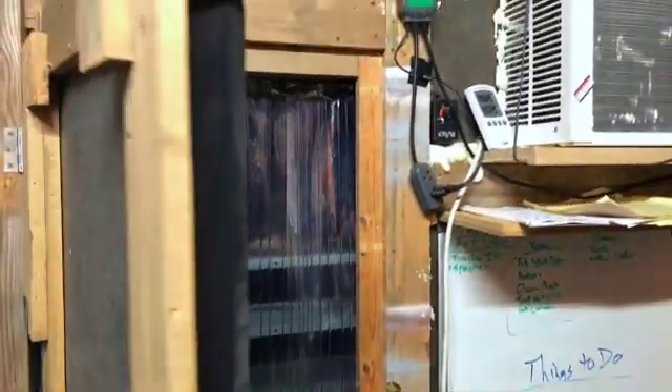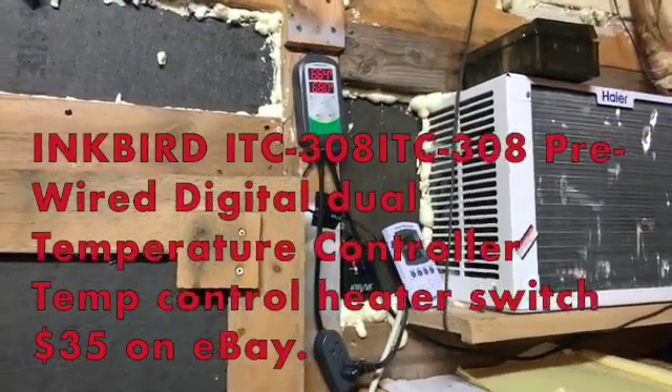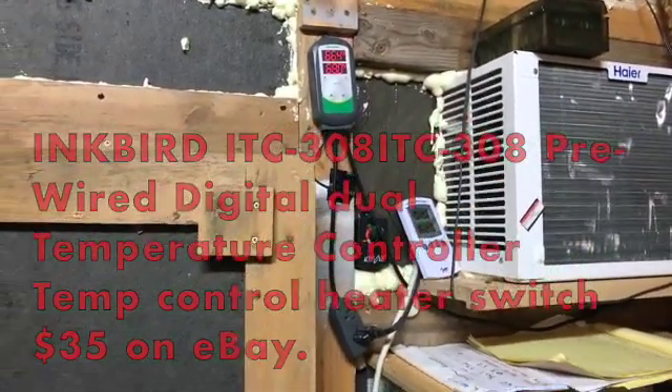There's a bunch of jars that are done in the back there. So that's our spawn room, our incubation room. This stays a great temperature — we keep it around 66 to 70 right now.